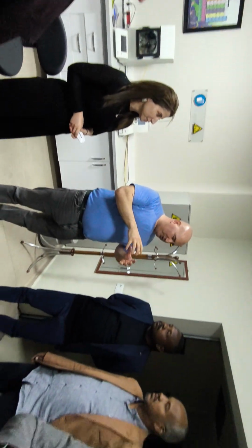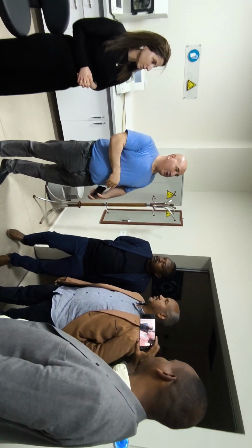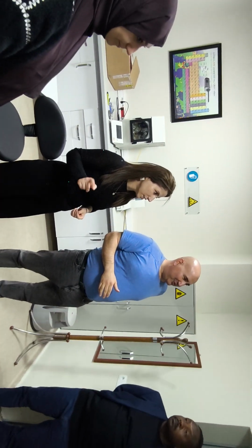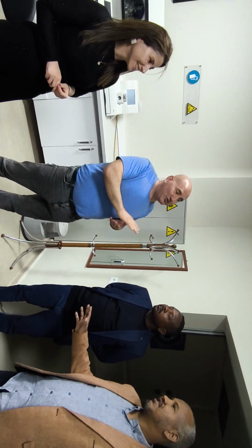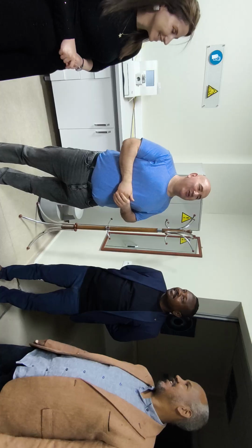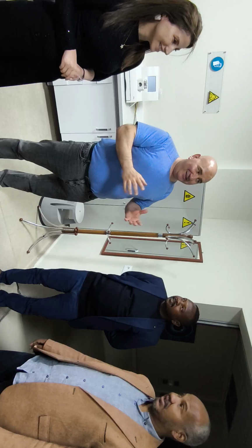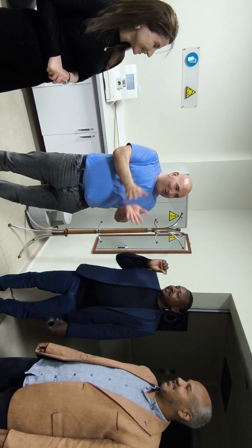And we can go up to 1 million magnification, which is very important, with less than 1 nanometer resolution. For you, there is no need for nanometric size, but if you are working in electronics, you need it, and we have to offer service to everyone.